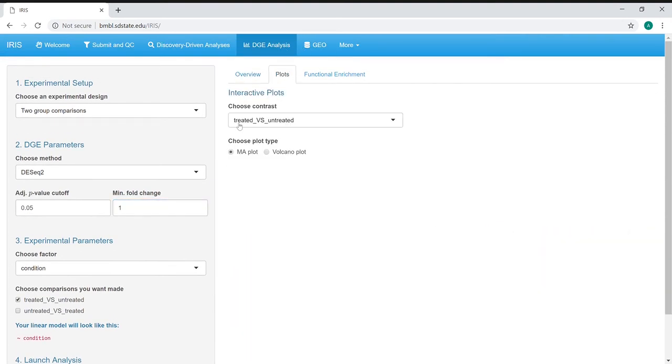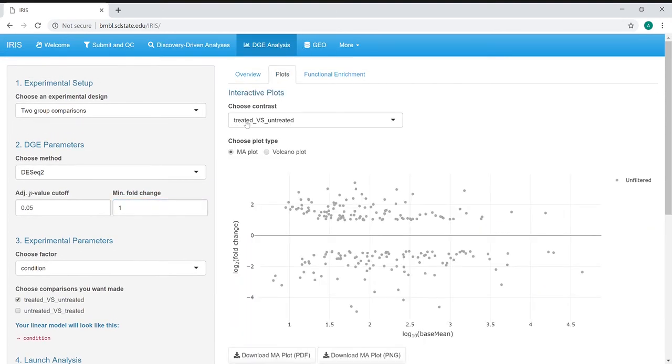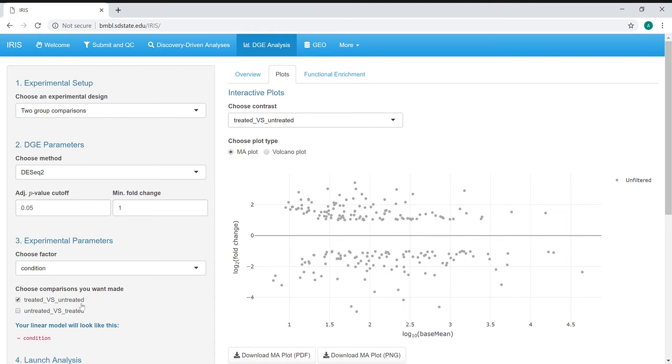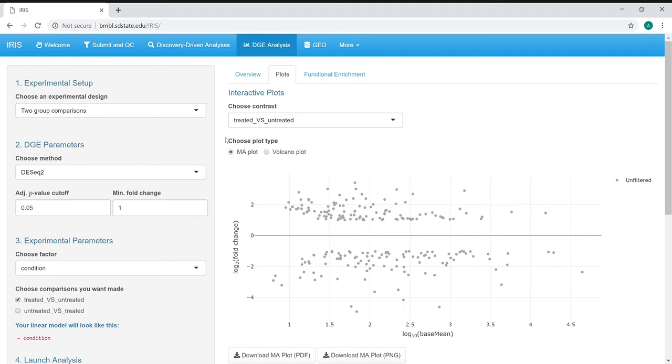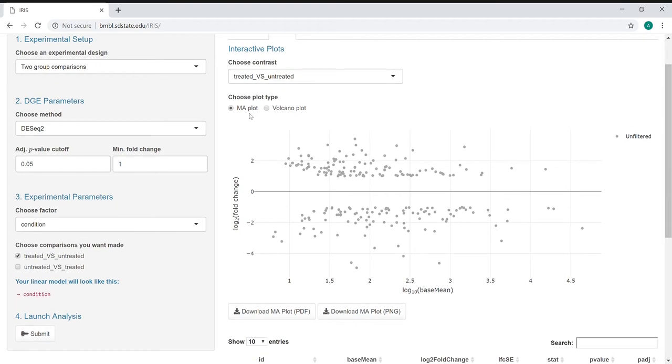Then we can move on to the plots. We can choose the contrast that we'd like selected. If we'd selected different comparisons earlier, we'd have different options here, but we only selected one. We have two options: the MA plot and the volcano plot, each of which has a specific use.